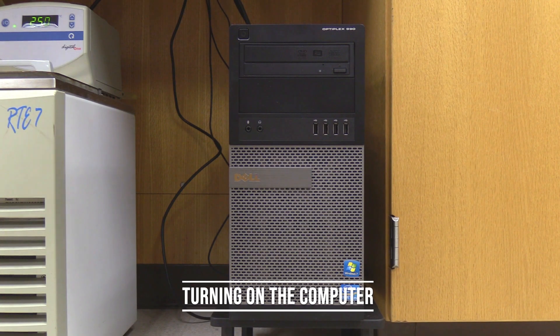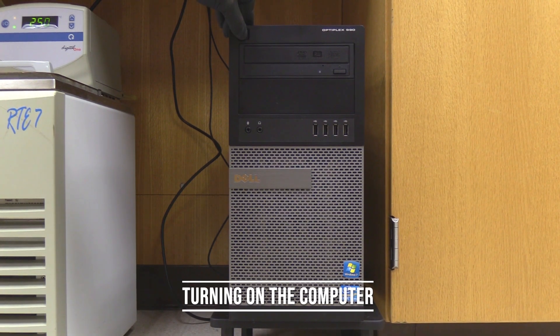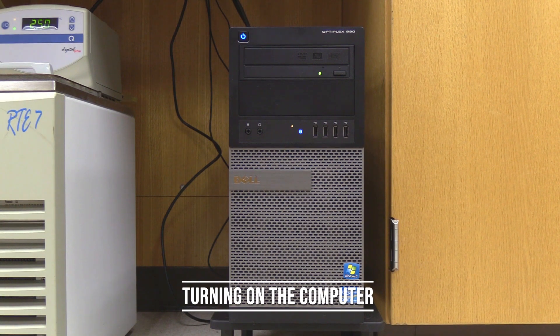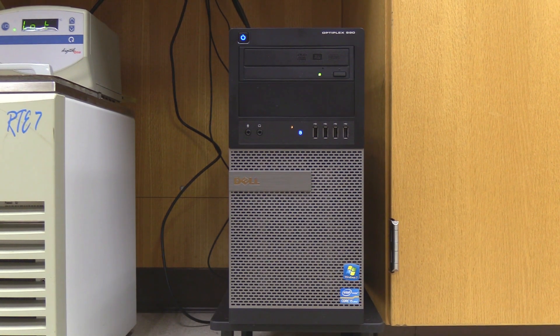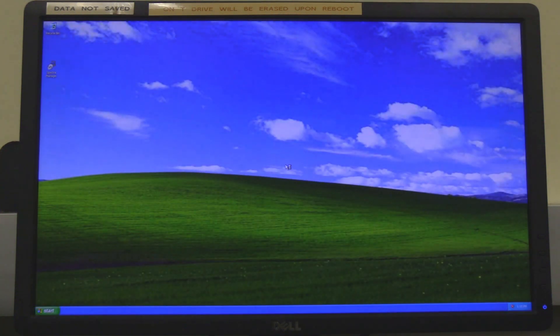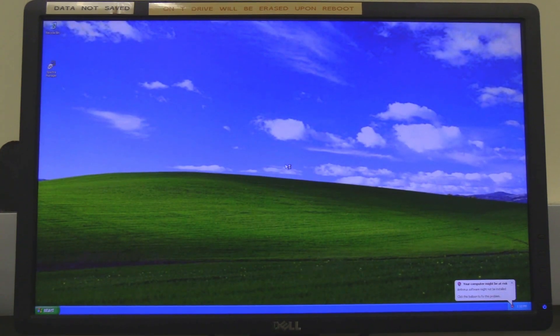Turning on the computer. Press the power button on the top left corner of the computer tower. Next, log in to the instrument computer. The username and password are found in the instrument SOP.